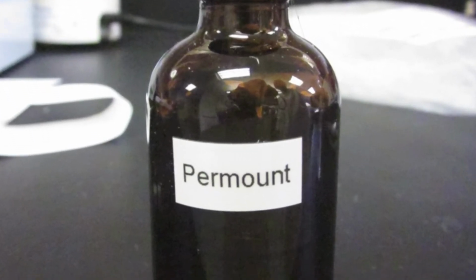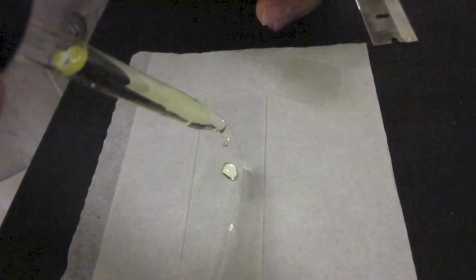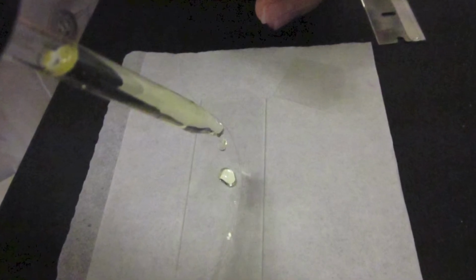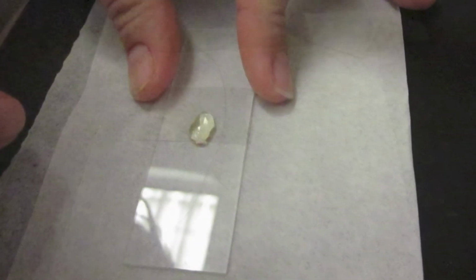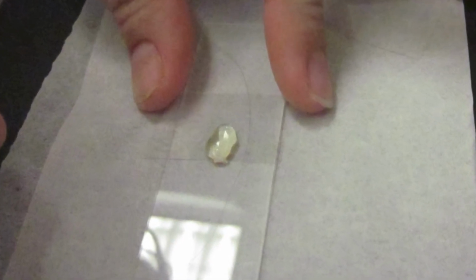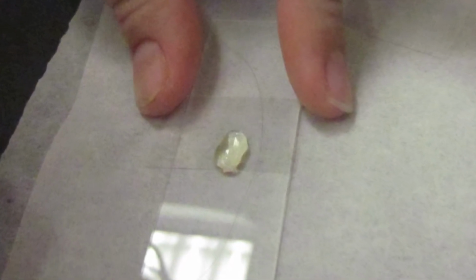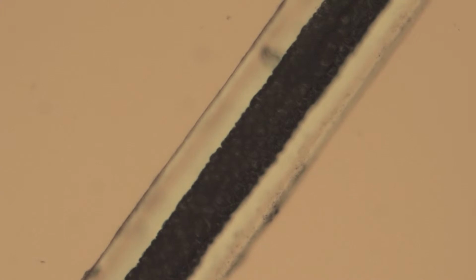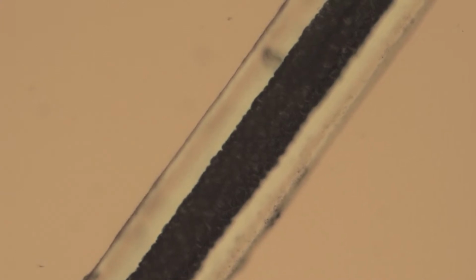To create a slide using Permount, the analyst needs the Permount mounting media, a glass slide, and a cover slip. After placing the sample on the slide, the analyst will add 1 or 2 drops of the Permount to that slide. Then the analyst will slowly lower the cover slip at a 45-degree angle to the slide until it is placed. This helps prevent air bubbles from forming underneath the cover slip. After laying the cover slip, the slide is now ready for view under the compound microscope.